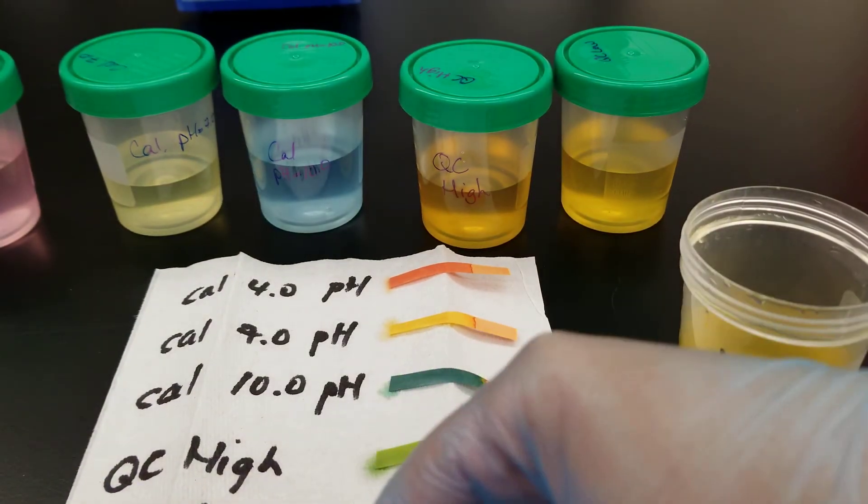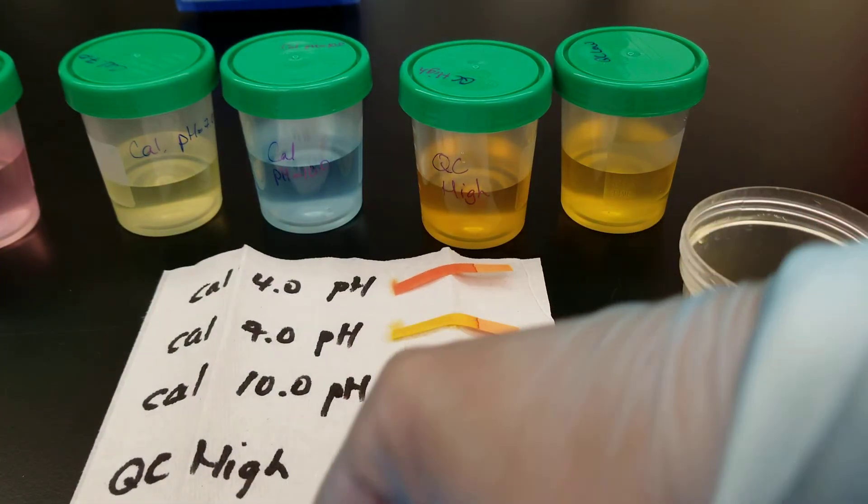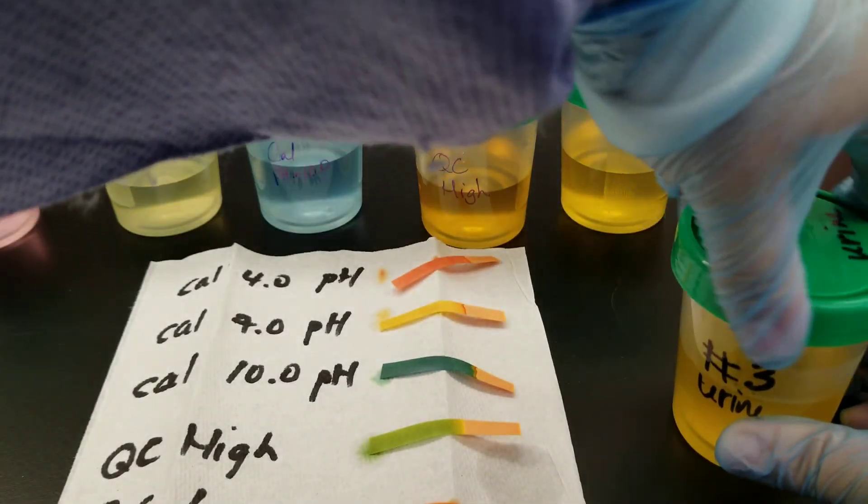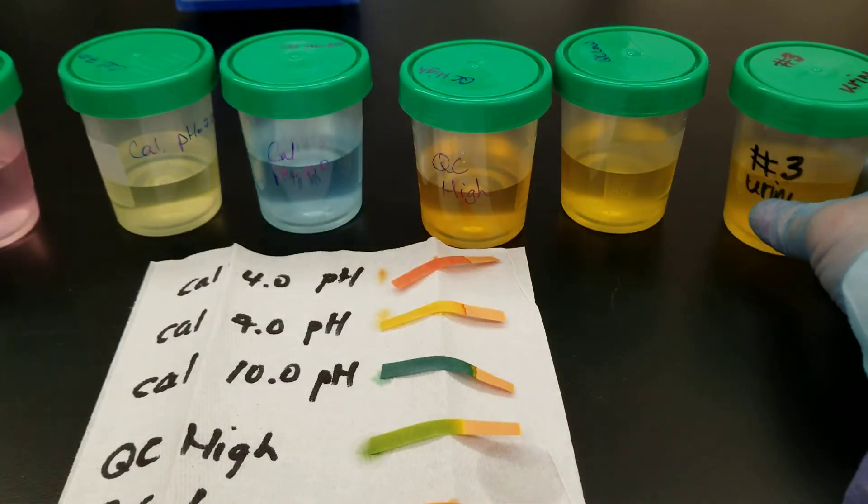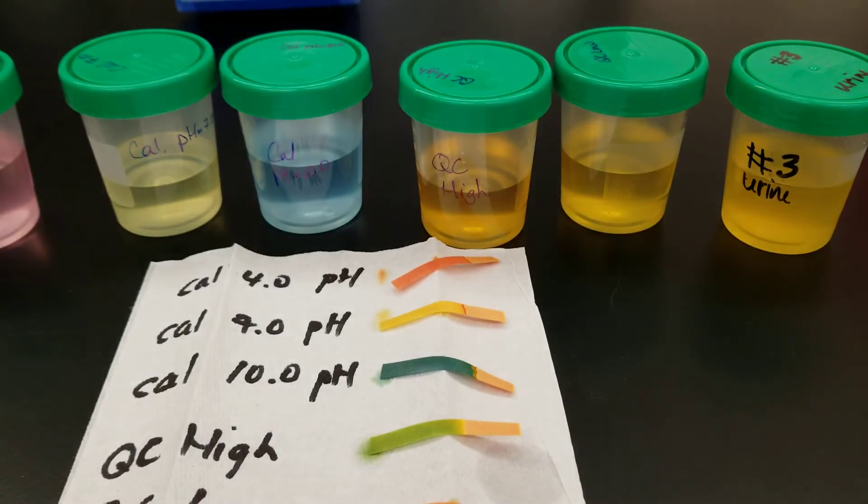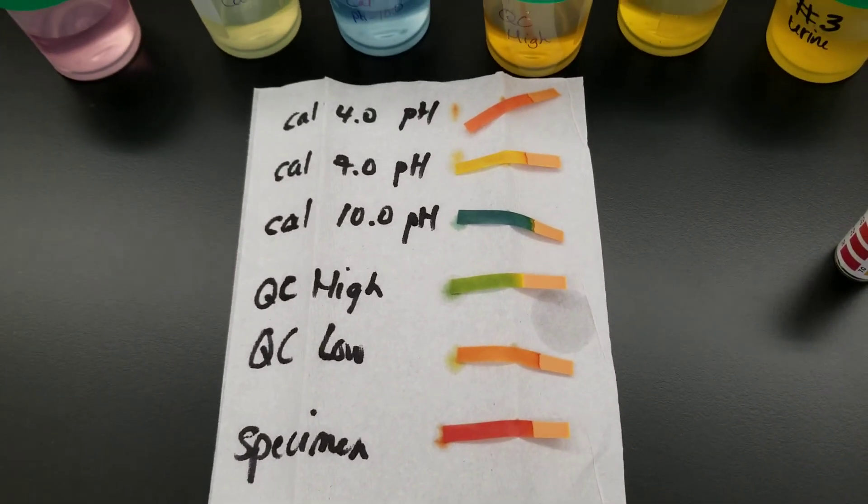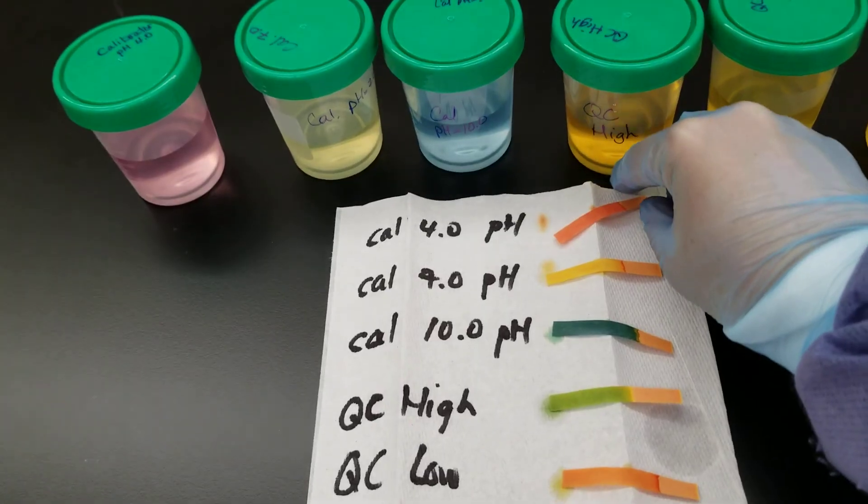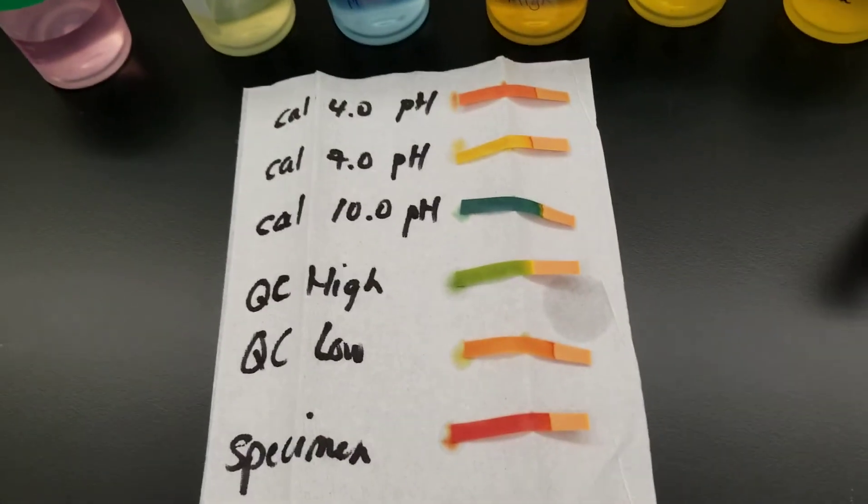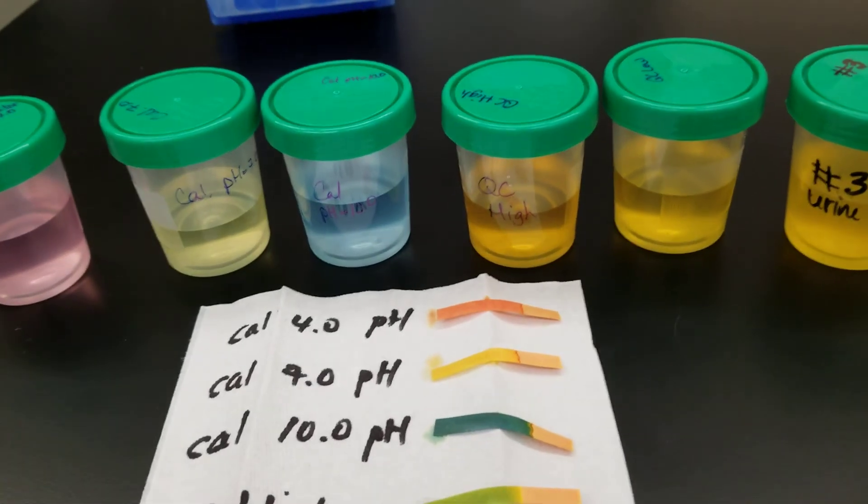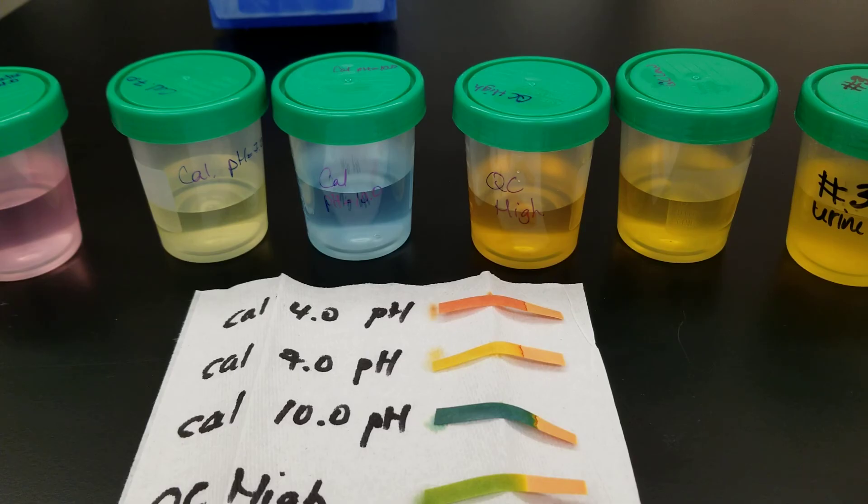The thing that you will be doing in the lab that I'm making this video for is you're going to be discussing whether your pH meter matched the pH paper and which one is more accurate and why. We can take a look here. All those beautiful colors. They did match pretty well from what I remember. Remember to do them when they're wet because otherwise when they start to dry, it still may change. Thank you so much for watching and have a great day.